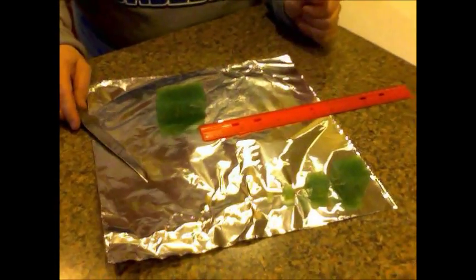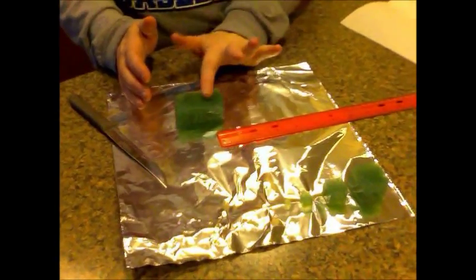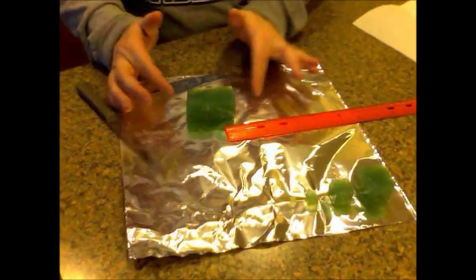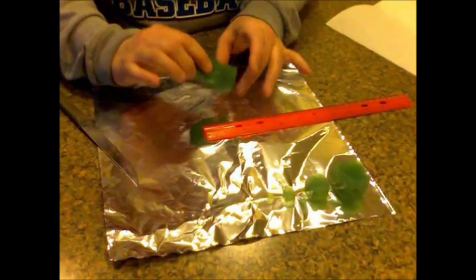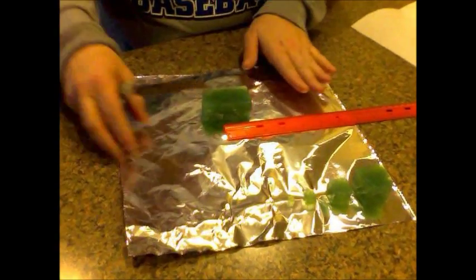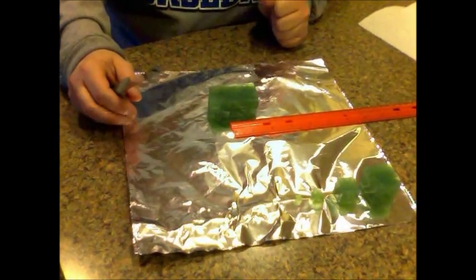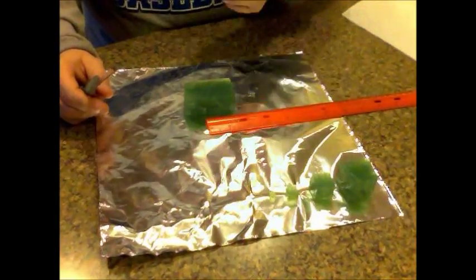Today we are going to use a block of agar that's been dyed with some universal indicator. It changes color when it's in contact with acids, and we're going to use it to represent cells. What you're going to do with this block is eventually cut it and end up with four different blocks that each represent a cell, obviously of a different size.